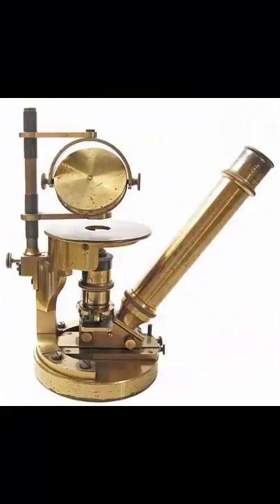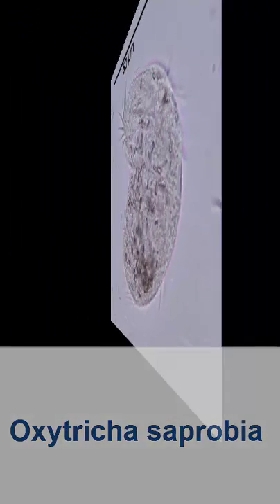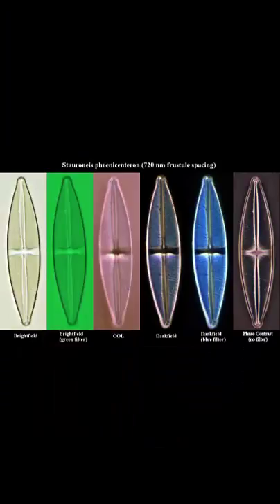This was a radical shift from the existing microscopes, where the specimen had to be small and preserved on a slide. For the first time, living and large specimens could be observed. This is an excellent microscope for metallurgical samples and for the observation of living specimens or tissues. Therefore, the process of cell division can be examined, which is not the case using a conventional compound microscope.